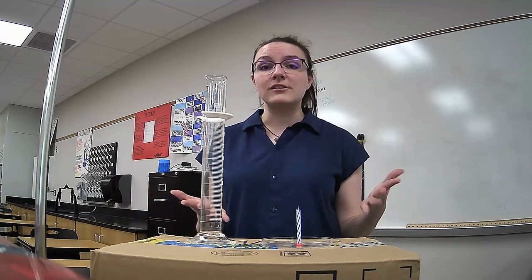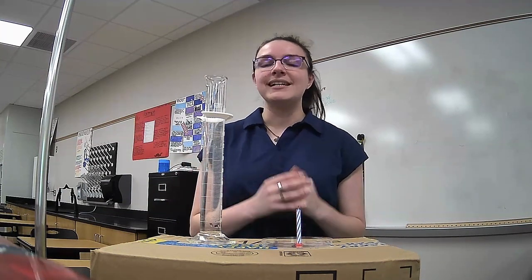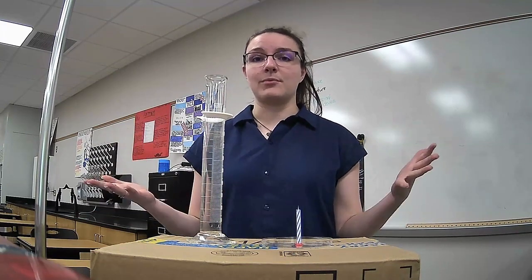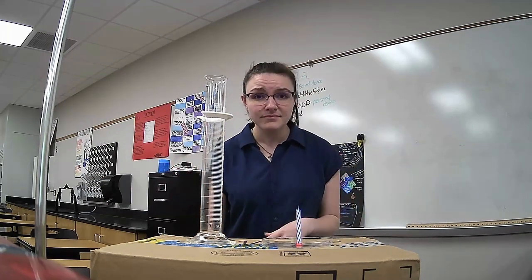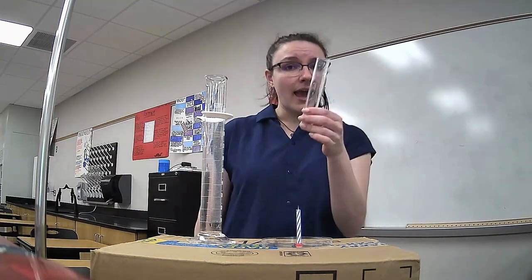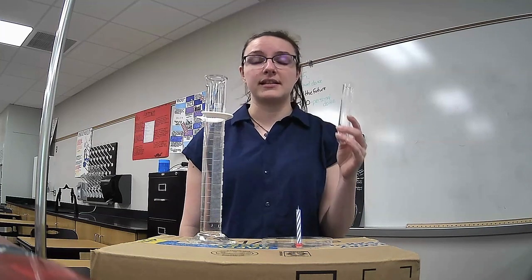And so today we are going to use a candle and some water and test tubes to see how this candle uses oxygen, and we use the fact that it is combustible to figure out how much oxygen there is in the atmosphere. So the first thing I'm going to need to do is figure out how big this test tube is. What is the volume of this test tube?